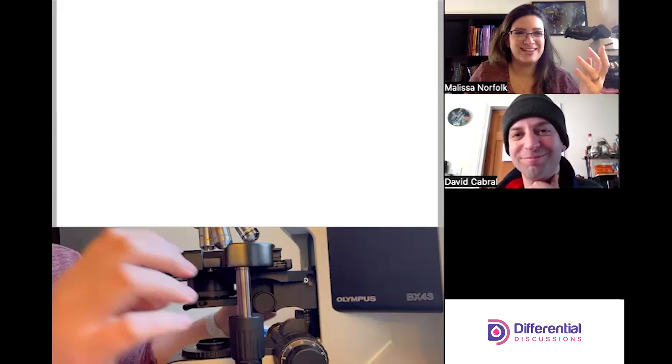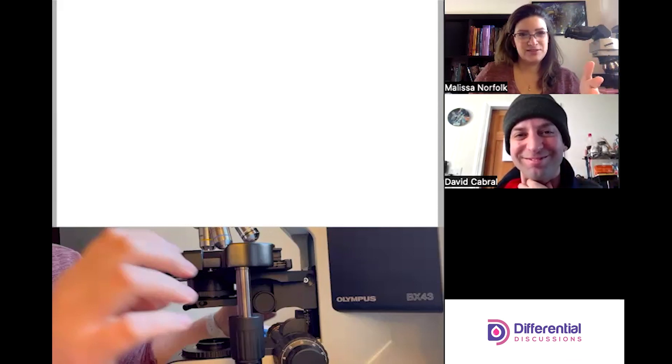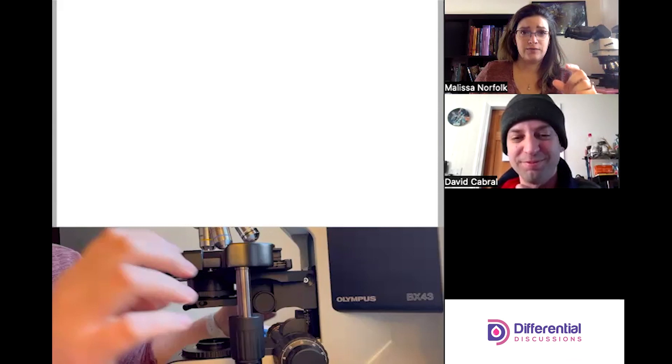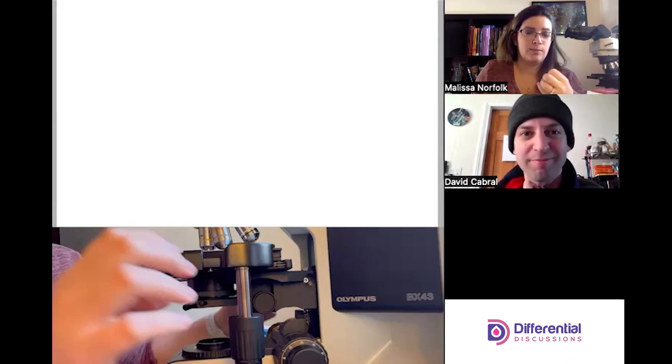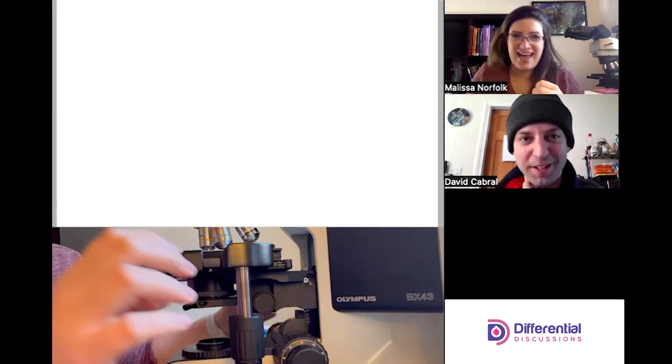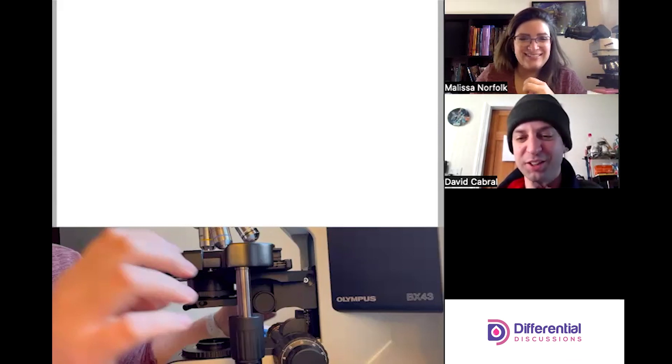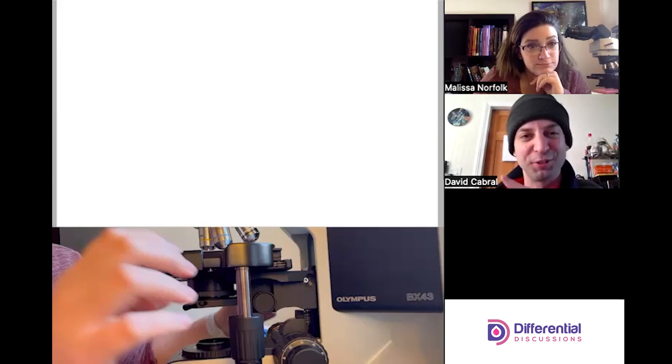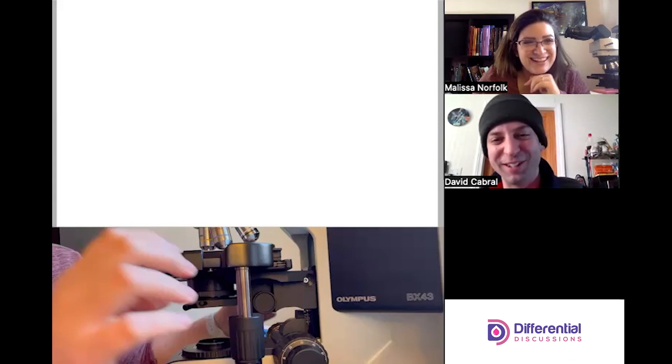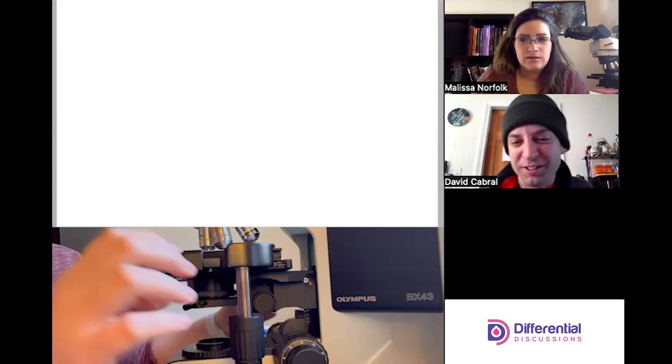I was able to get these two videos together, so what you're going to see in the video once we play it for you is actually a view of what in the microscope looks like and what I'm doing outside of the microscope at the same time. This is definitely a production difference for us in how we usually operate.